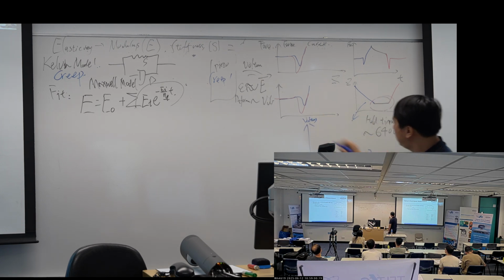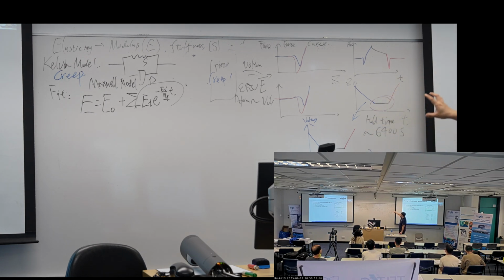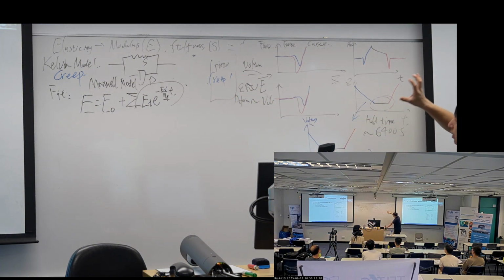The voltage against the time will be up. So that's my idea about how I want to control this movement of my scanner. But as we said, on this step, there is a creep. So ideally, I want my Z to be something like this.